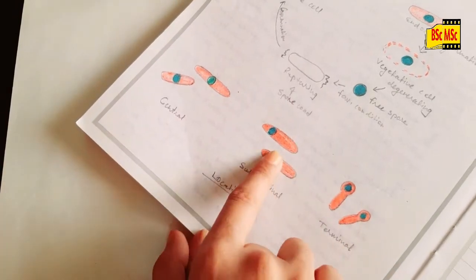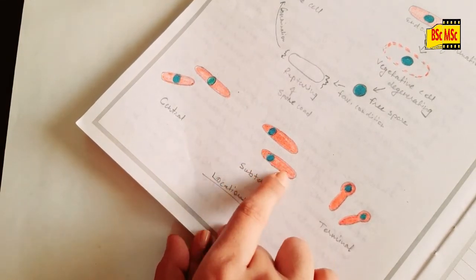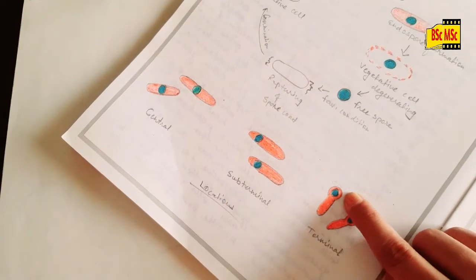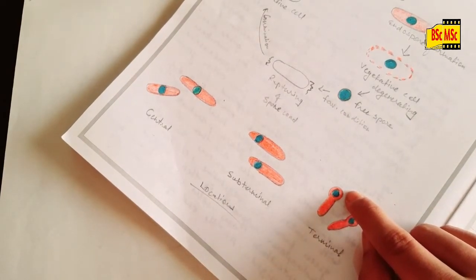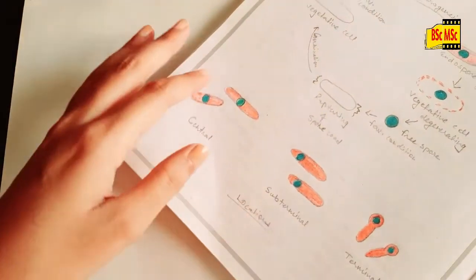These are the subterminal ones, located not at the center, not at the end, but in between, so it is called the subterminal location of the endospore. And these are the terminal ones: you can easily see they are present at the end of the parent cell. It is really important to remember these locations.